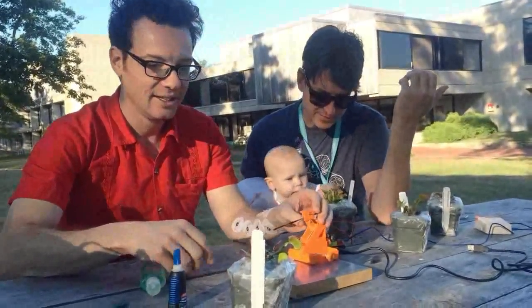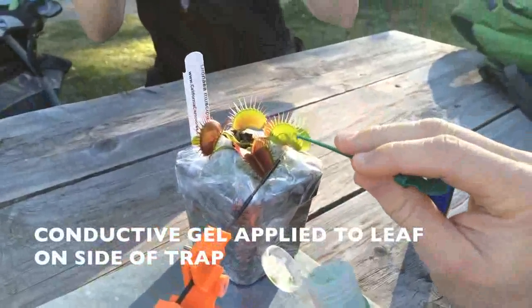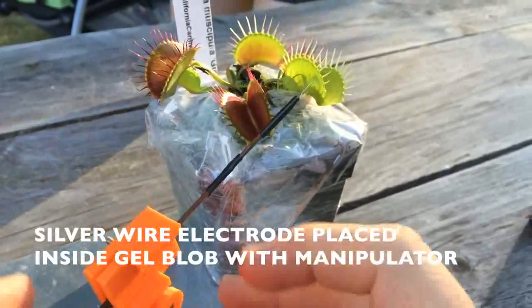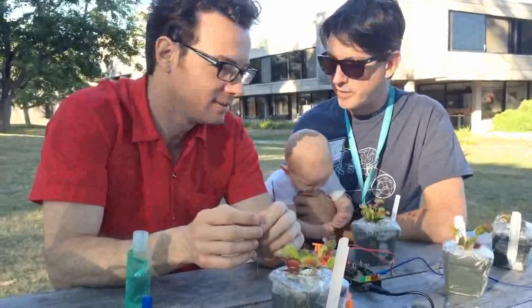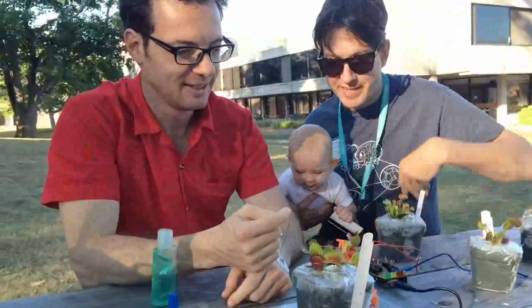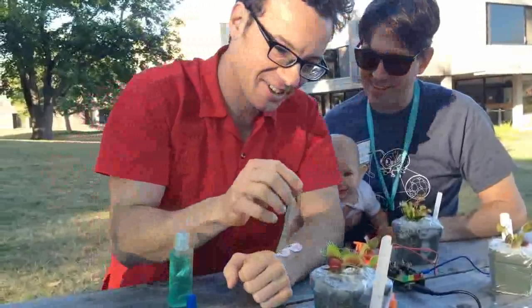You have the plants? Yeah, we have the plants, and we have this manipulator. You gonna put some stuff on? Yep. All right. Oh, you got the electrode in place? Well, I have the electrode on the side of the plant, but I don't really know what to do about this ground wire. Tim, it's ground. You can stick it in the ground. Ground the ground in the ground? Ground the ground. In the ground.